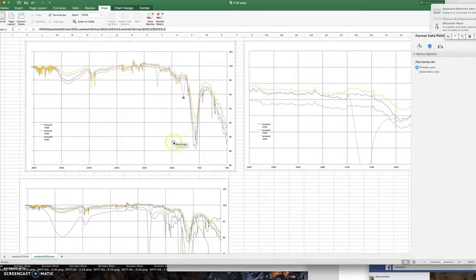So I'll just make another sketch in another tab where I show this gray one together with PLA and see how well they fit with each other. I'll send this sheet to you, this Excel sheet, so that you can play around with it.